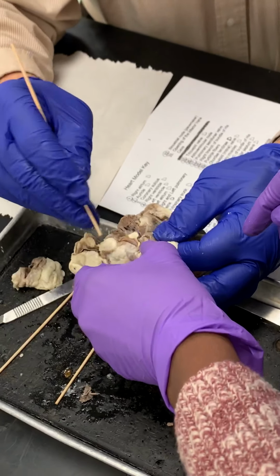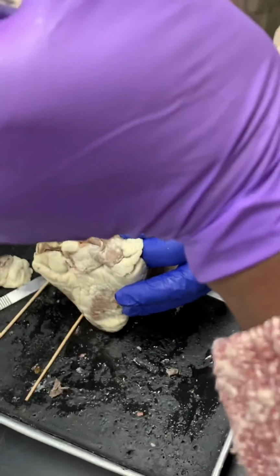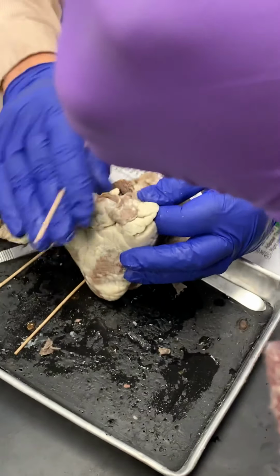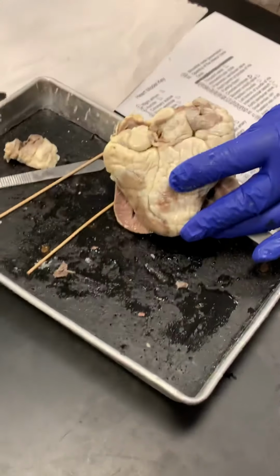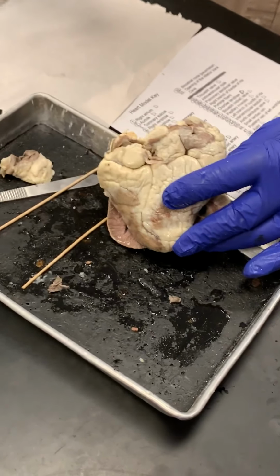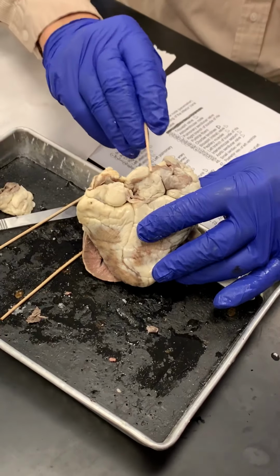No, I think I would say the brachiocephalic got cut. Usually half the time you see it, half the time you don't. But if it's cut very close, you don't see it. Is the brachiocephalic on the right? It's off of the aorta, right? It's the first of the first branches off of the aorta. Where there's those three branches, the brachiocephalic is the first. Okay. So it's in the aorta, the beginning of the aortic arch.